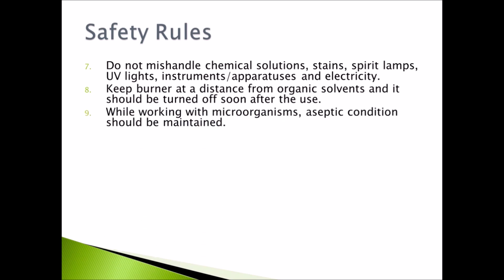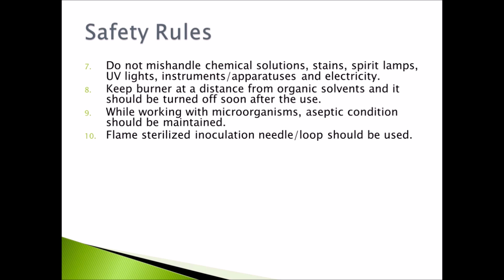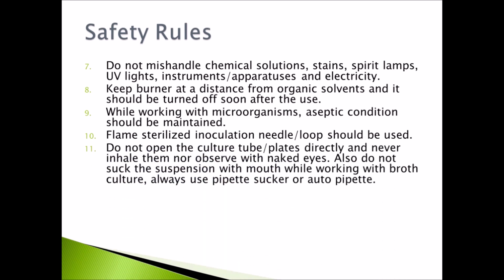Then, while working with microorganisms, aseptic conditions should be maintained. Then, a flame-sterilized inoculation needle or loop should be used. Do not open the culture tubes or plates directly and never inhale them nor observe with naked eyes. Also, do not suck the suspension with the mouth while working with broth culture.